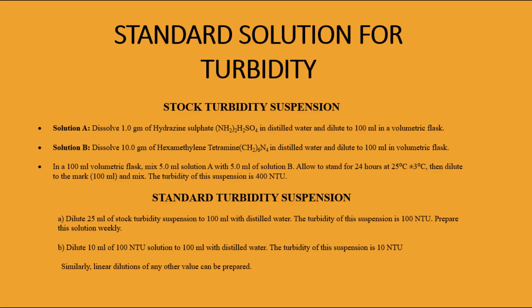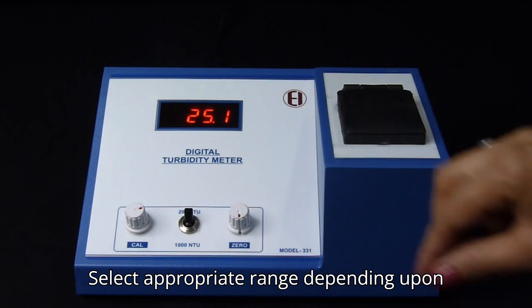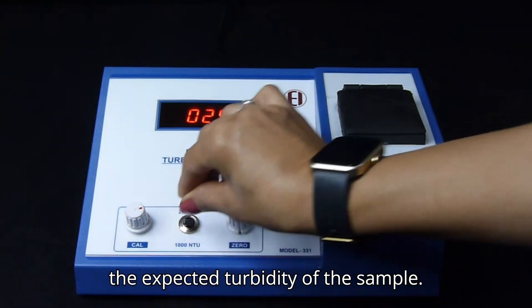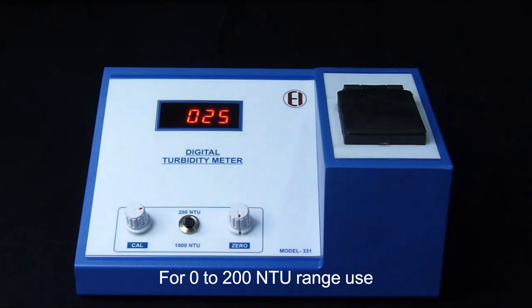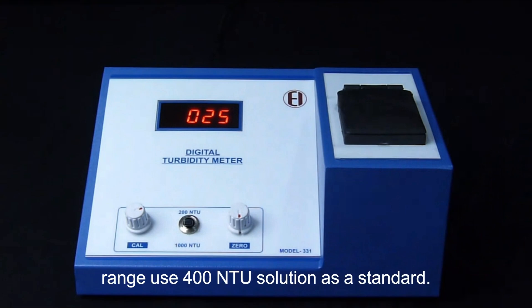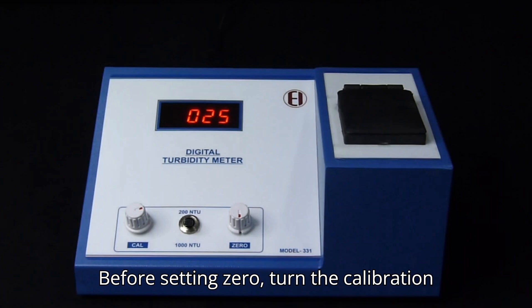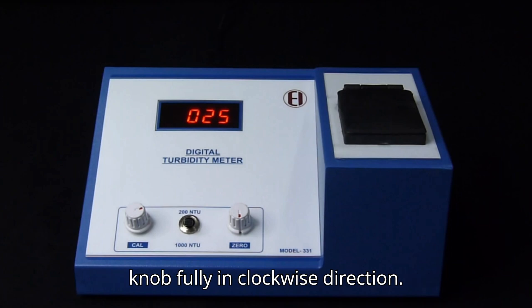The standard solutions can be prepared by using this method. Select the appropriate range depending upon the expected turbidity of the sample. For the 0 to 200 NTU range, use a 100 NTU solution, and for the 0 to 1000 NTU range, use a 400 NTU solution as a standard. Before setting 0, turn the calibration knob fully in the clockwise direction.